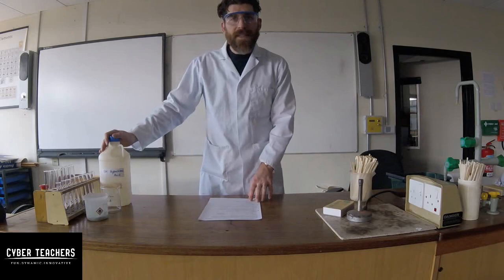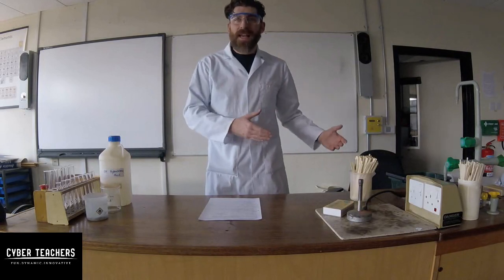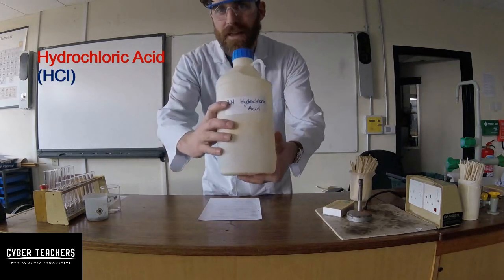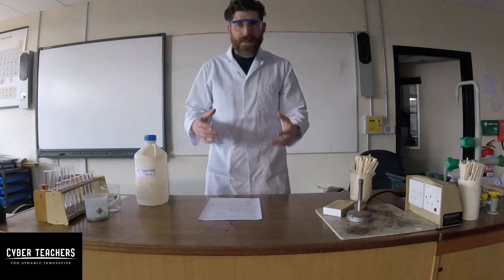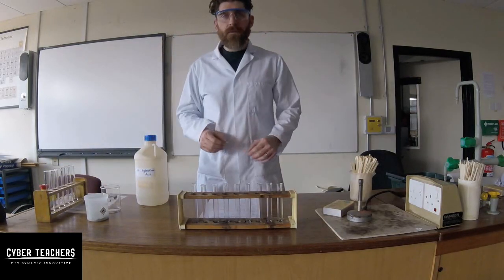We need to look at making hydrogen. When you react a metal with an acid it makes hydrogen. We've got hydrochloric acid here — this is particularly nasty stuff so we need to be very careful with it. We're going to take a test tube and add some metal to it.